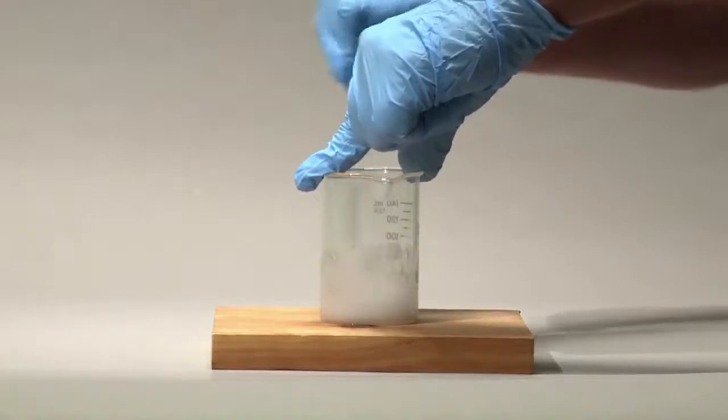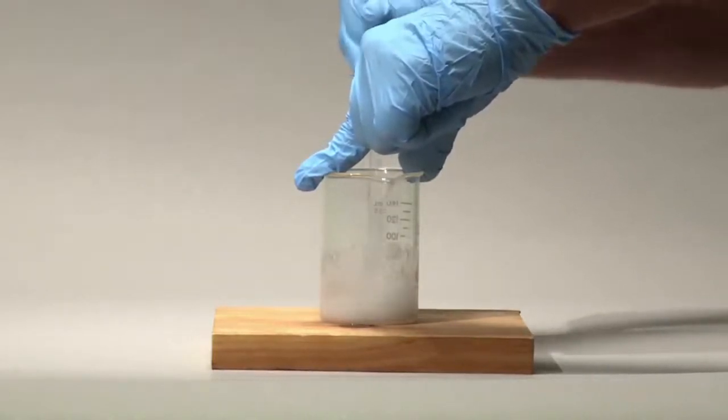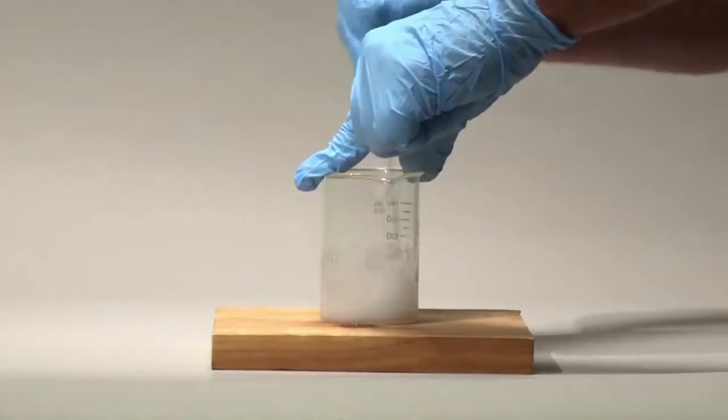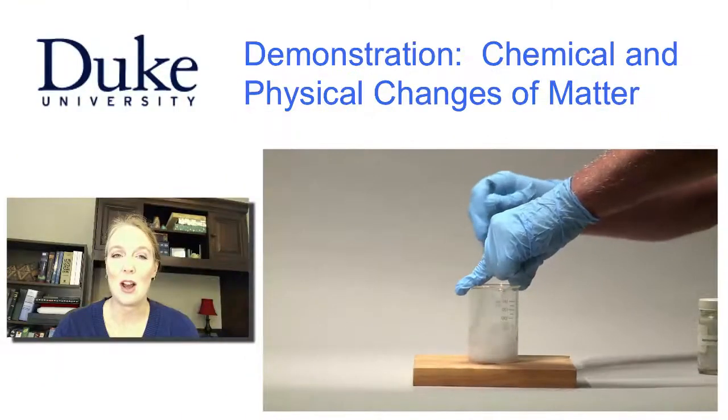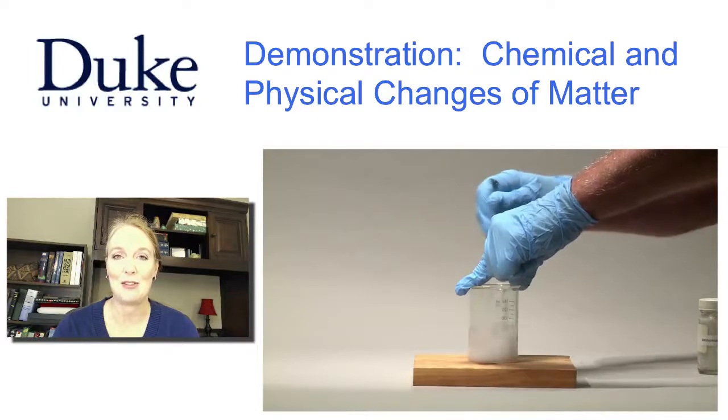Did you notice that it is getting kind of slushy or wet? This is because water is a product of the reaction. Water is a common product in many acid-base reactions, although not in all of them.